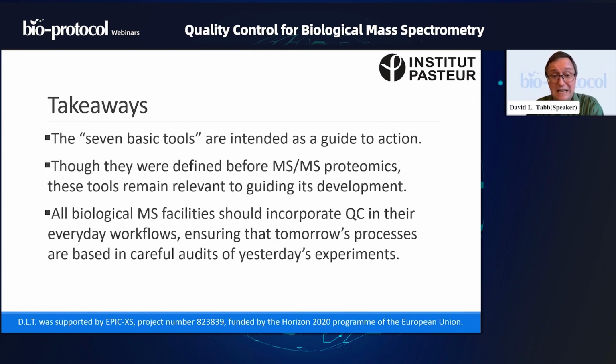Okay, this brings me to my last slide. Several takeaways that I hope everyone can grasp right away. The 7 basic tools are intended as a guide to action. This is a bit of a challenge, actually. Imagine that you ran quality control samples on your instrument every day, but you didn't bother to come back to those data sets to understand the typical performance of your instrument.